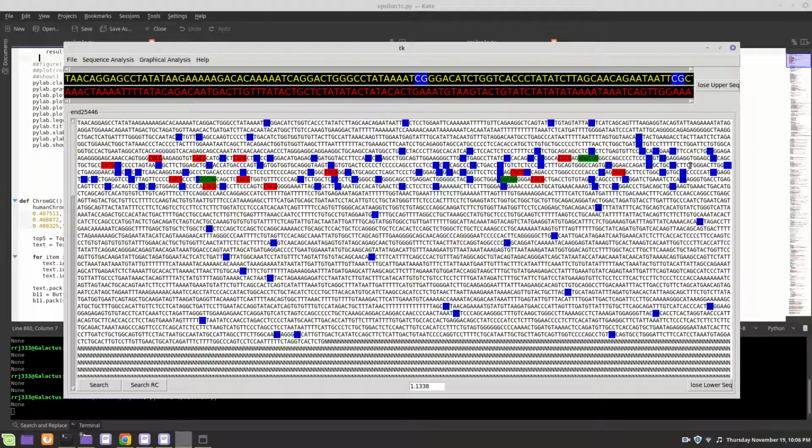1,000. Where are we? 440. Like right about here, CA. Now, where is this? Well, this is a CA. It looks like a good spot.